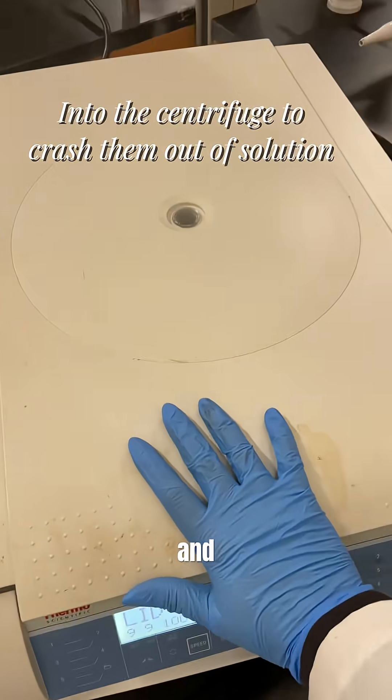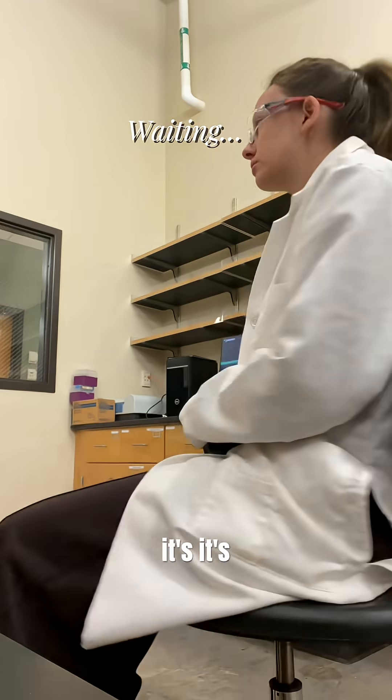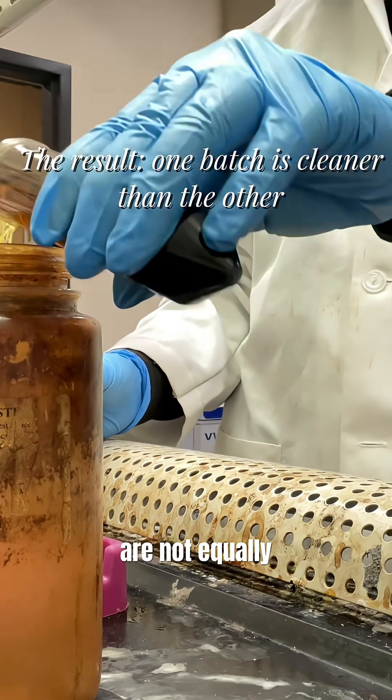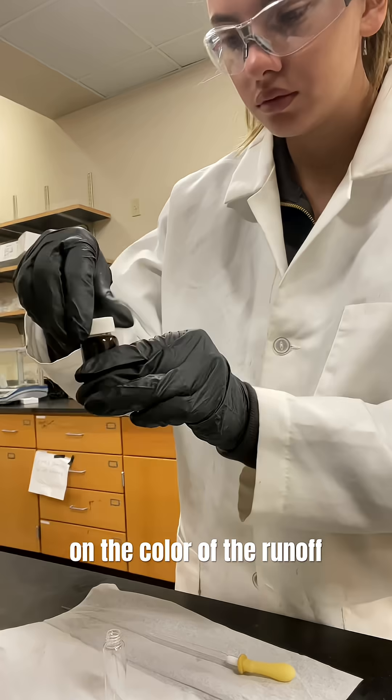We do this four times and it's kind of boring, so it's quite a process. But you can see here that the two different batches are not equally clean based on the color of the runoff.